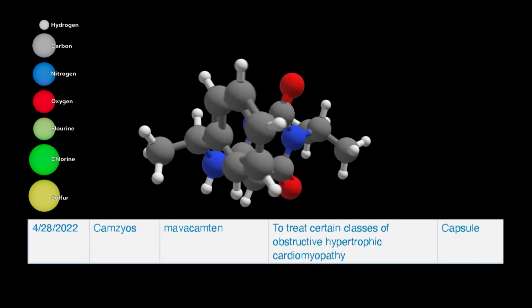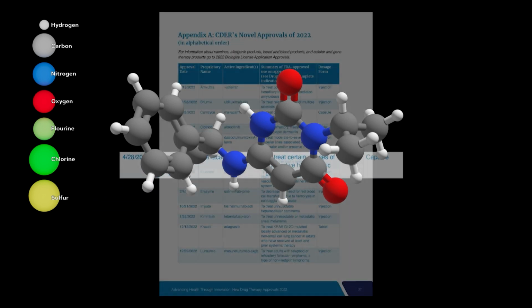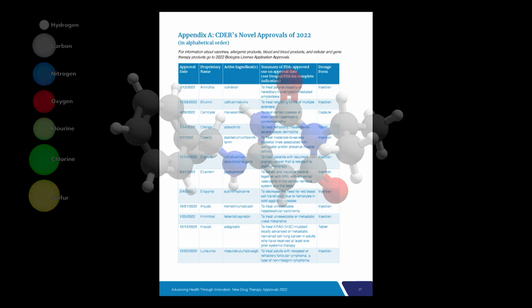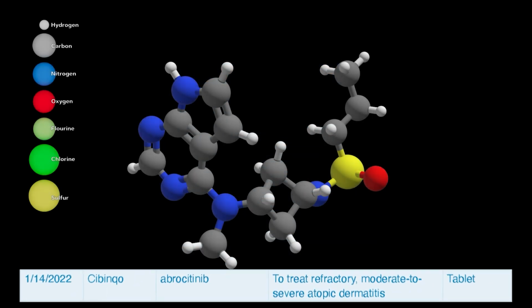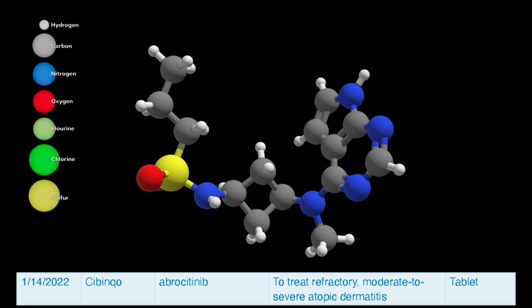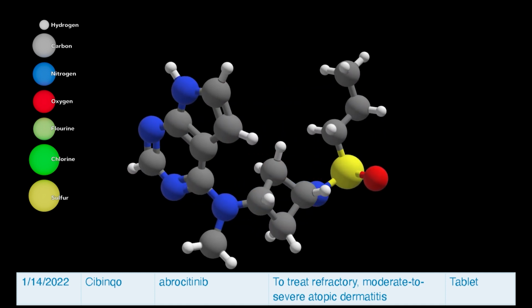High-performance liquid chromatography plays a crucial role in the discovery of drugs by enabling the separation, identification, and quantitation of compounds within complex mixtures. HPLC is a powerful analytical technique used in the early stages of drug discovery to evaluate the properties of potential drug candidates. Here are a few of the steps in which HPLC is a core asset.